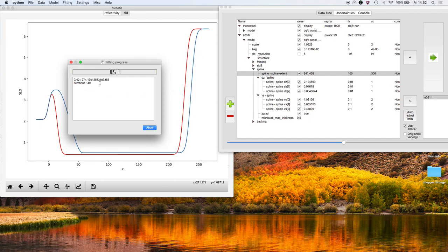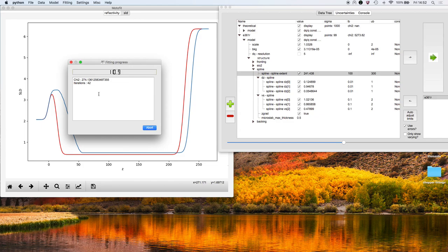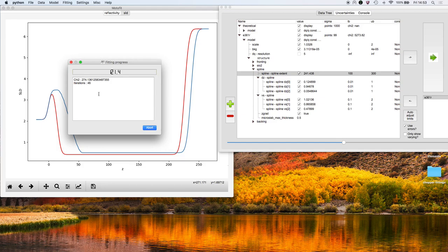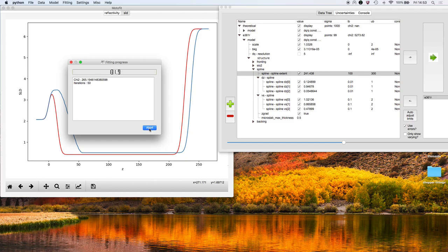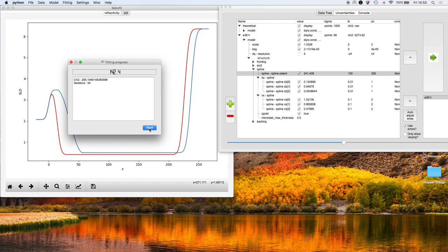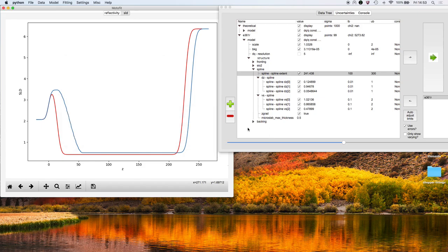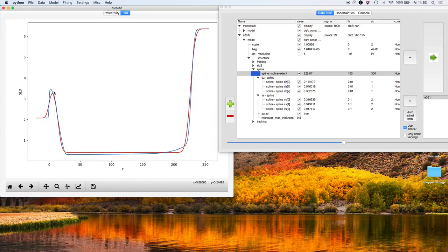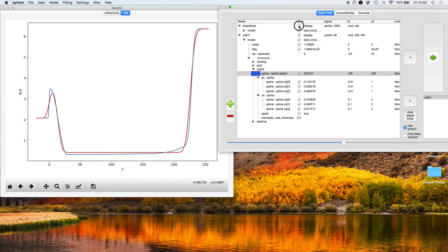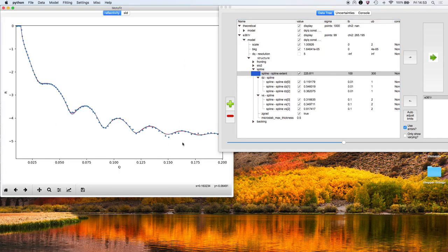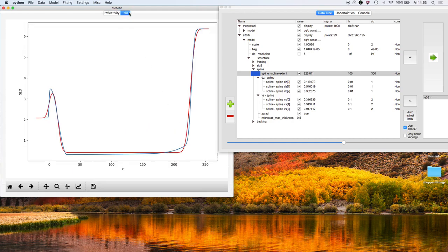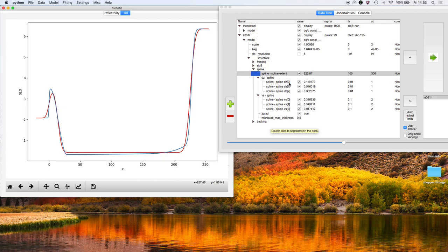When I did this with a single slab, the chi squared value was something like 250. The fit's still improving but going relatively slowly. I might just stop it there so that the video doesn't go on for so long and see what we come up with. That's what we've come up with so far. It's very similar to what we had with the slab model. The fit's not a huge amount greater. If anything, it's slightly worse. So probably in this case, it's not justified using a spline.